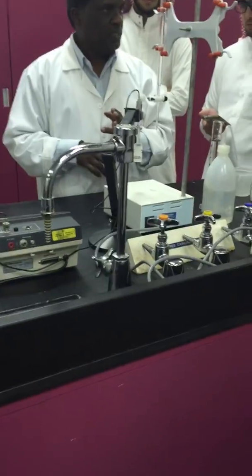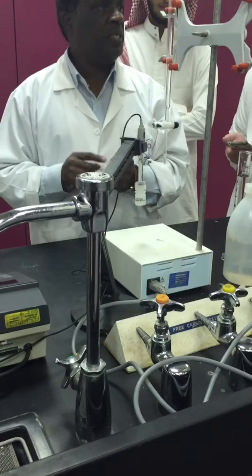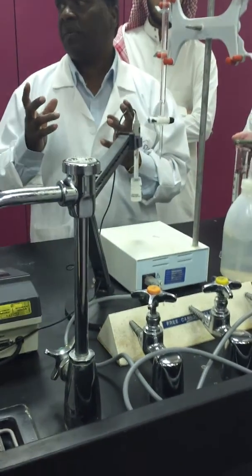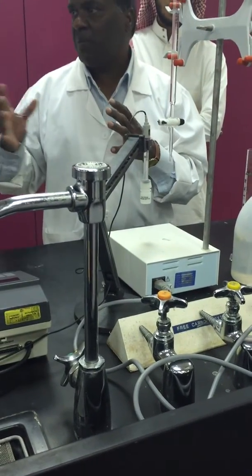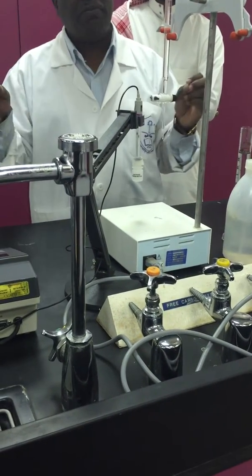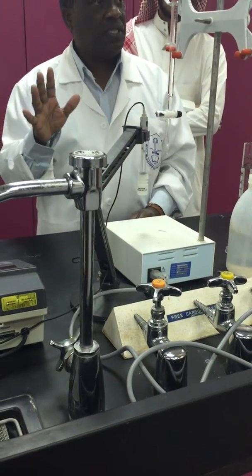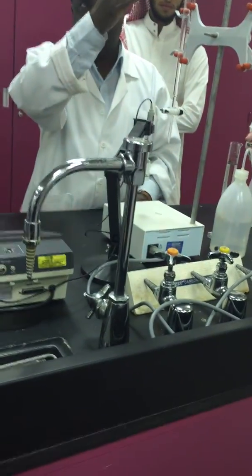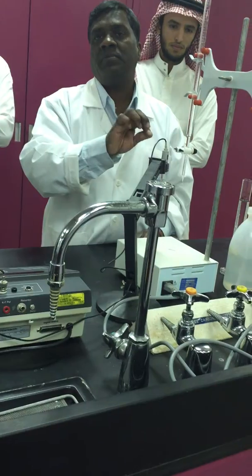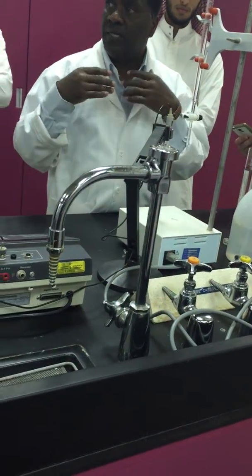pH and alkalinity, chloride, hardness, BOD, COD, nitrogen. Why these 6 experiments? All 6 experiments are similar. In all the experiments, you are going to do titration. COD and nitrogen? Nitrogen, yeah. So, in all the experiments, you are making titration. Okay. We did not include other experiments.